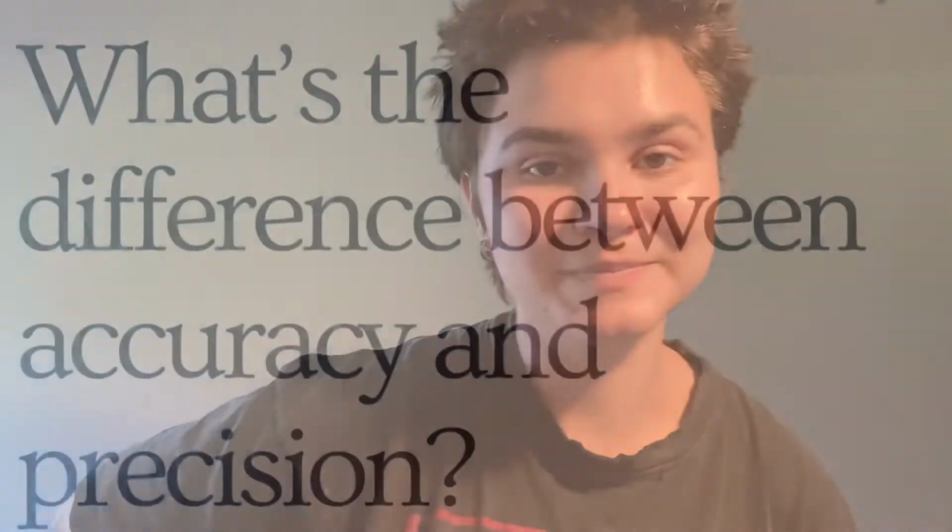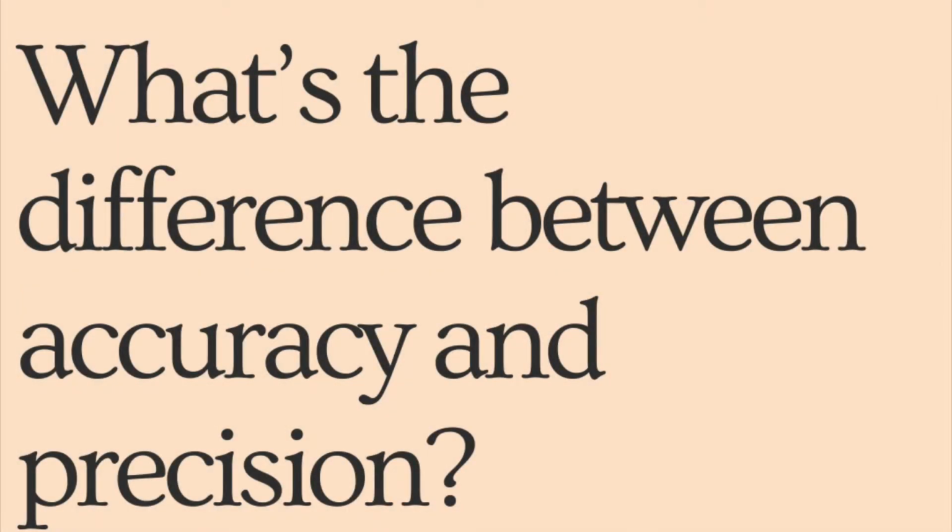You may be asking, why would we even use a micropipette? The answer is twofold. One is to ensure precision. The second is to ensure accuracy. Remember, precision is assuring that you get the same measure each time, while accuracy is assuring that the measure is as true to life as possible. Thus, using a micropipette allows us to conduct experiments that are replicable and trustworthy.